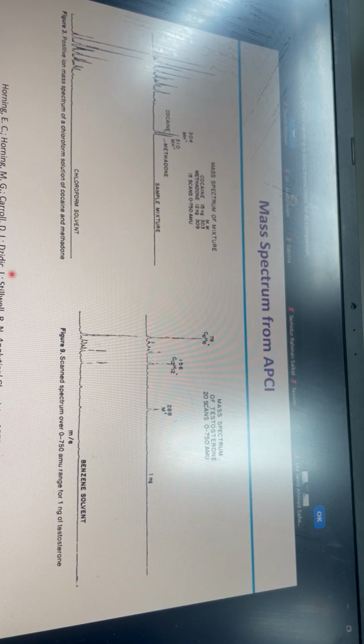I'm just showing the atmospheric pressure chemical ionization spectrum that they published around 1973. You see, Dempster and J.J. Thomson started everything around 1890. Then he got the Nobel Prize in 1901, and then around 1918 and 1919, Francis Aston built the first, second, and third generation of mass spec, and then Dempster in the USA built his.